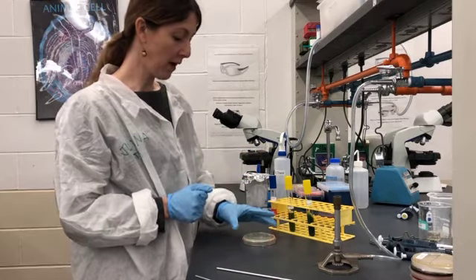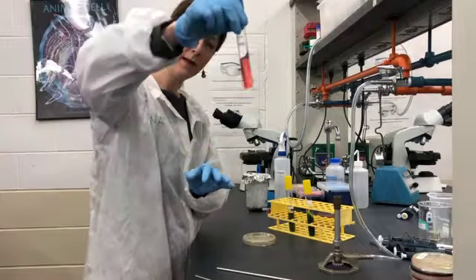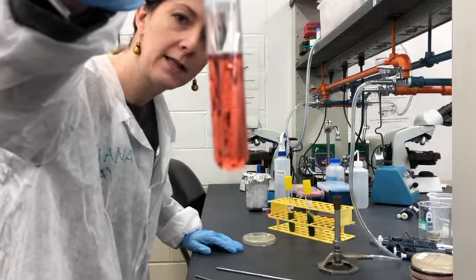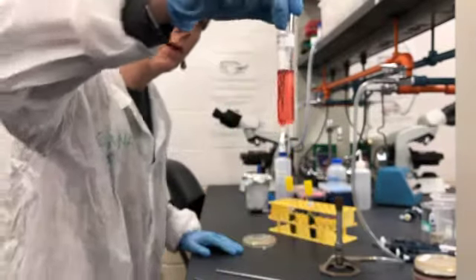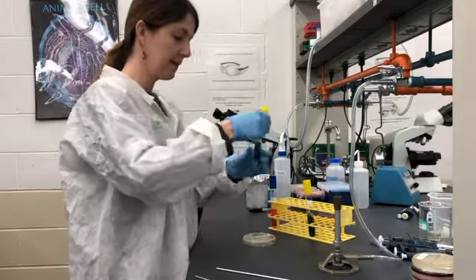So we're going to start off with a liquid media that you know and love. You've seen this before. What you might notice is that there's a Durham tube in this particular case of liquid media. And that Durham tube is just a small inverted test tube that's placed inside of the media. This is new media.